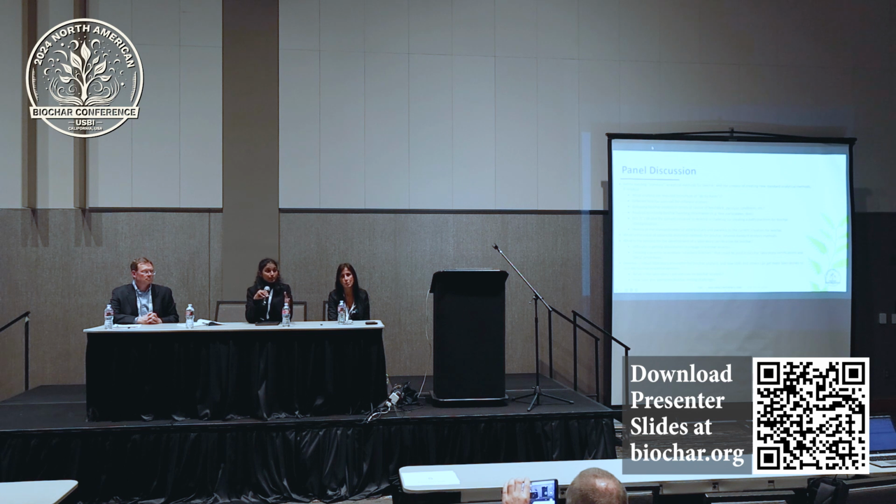That method is based on compost systems, where the nutrients are easily available and the release is quite fast, whereas in biochar they're held very tight, and the release can range from 15 to 50 years. For phosphorus, it's a lot longer than potassium. So we need better protocols, certainly for bioavailability of nutrients.